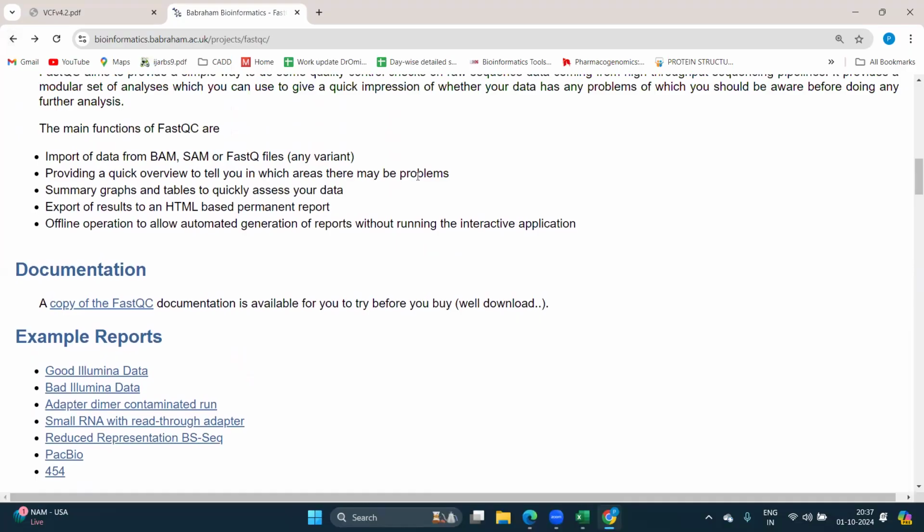I think you were asking me something else also. Ma'am, I was asking, if you want to give the fasta sequence, will I have to write sequence 1 or sequence 2? Yes, the header you can give anything. At the end, they will take the second line of your fasta sequence. Okay, ma'am.